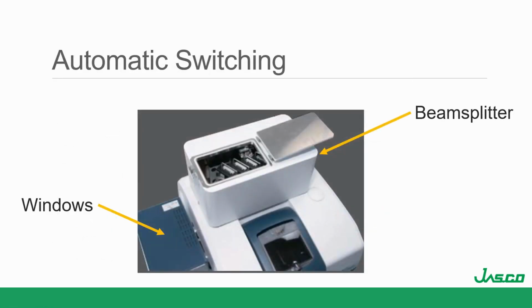So we talked about different beam splitters and different sources. If you're going to do full ranges, if you want to do far IR and mid IR, or near IR and mid IR, you need to change the beam splitter and the windows in between different methods because each beam splitter has a different useful range. So one thing you can do is get an automatic beam splitter changer with automatic windows, and then there's automatic detector switching as well in the bench. So these allow you to switch wavelength ranges without having to break your vacuum or purge.